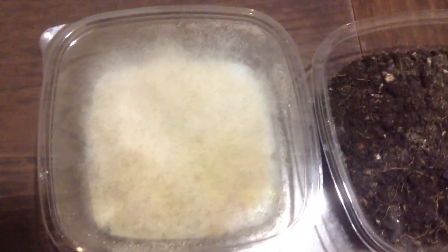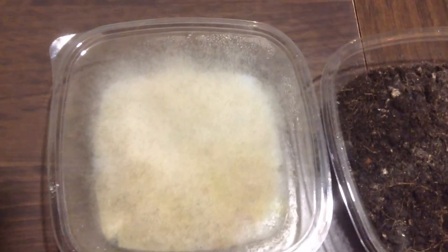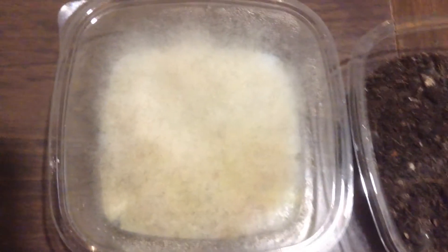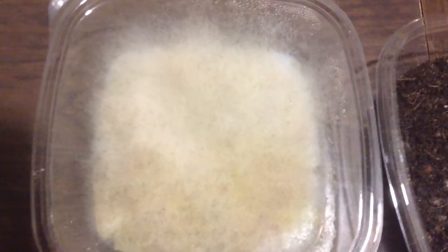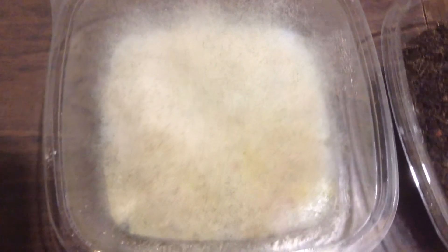I'll just try to get you a closer look — yeah, that's a furry whole bunch of colony. There's probably more life there than on the planet Earth if you wanted to compare humans versus bacteria or fungi. A ton going on there — it's a whole world system.